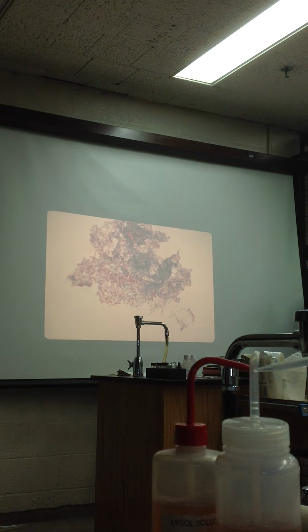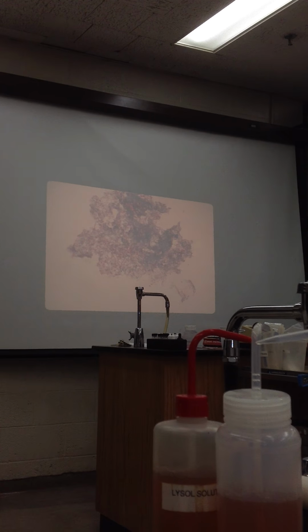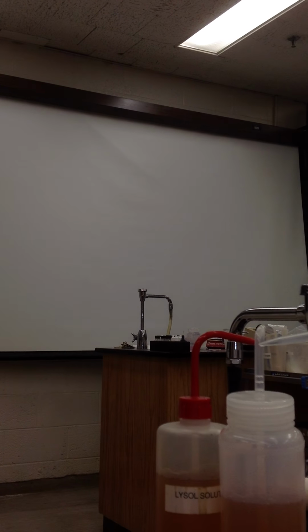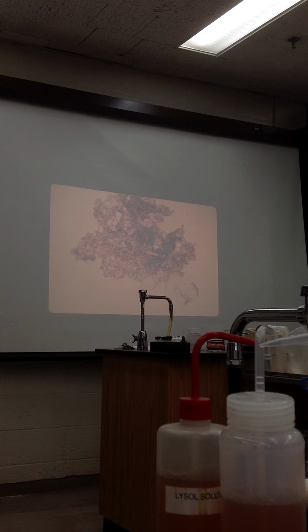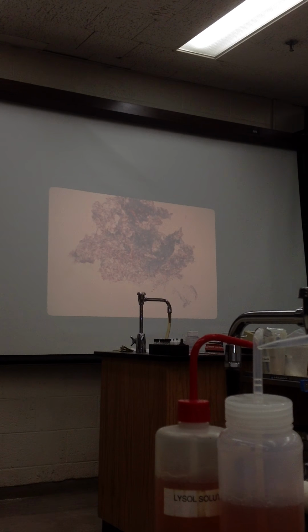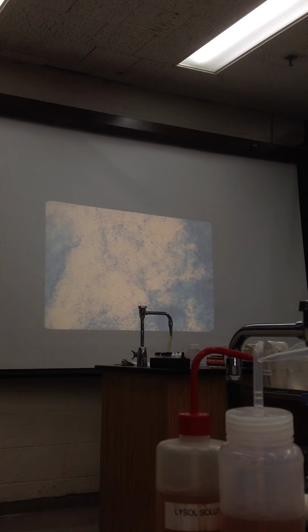Once you see that, you figure that's not a gram stain, because a gram stain would give you purple and pink. So right there you say, well, that's an acid-fast stain. You look to see if you see bacilli. So this is another stain. You notice that blue background and red bacilla. So that would be an acid-fast stain with an acid-fast bacilla.